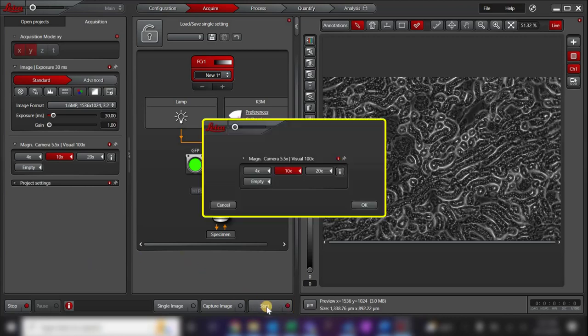The software will open a pop-up window to check that the correct objective is selected for the image. This will ensure that the pixel size is recorded accurately for drawing scale bars or measuring features in your image. In this case, the correct objective 10x is already selected, so I will click OK.